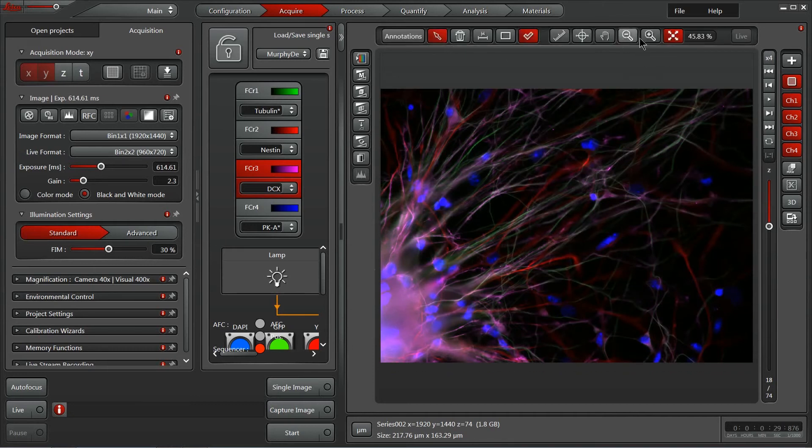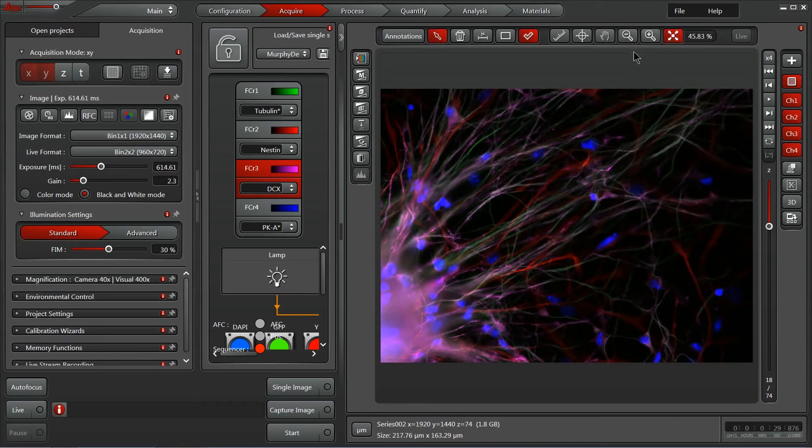We also have easy navigation buttons here, zooming in, zooming out, fitting it best for the display size, all available with the click of a button.